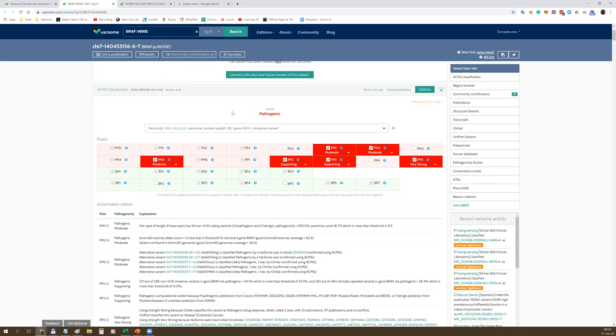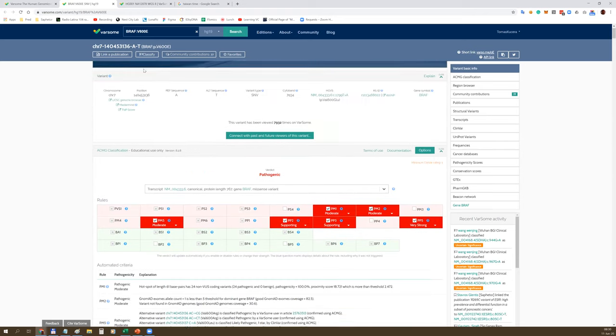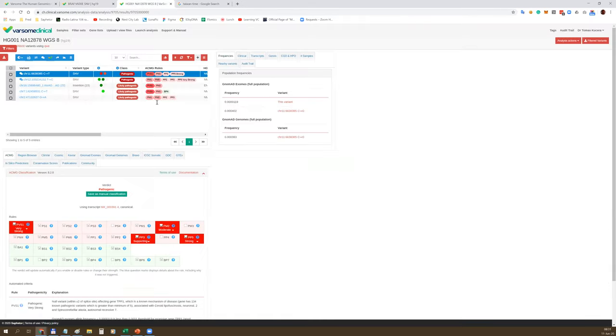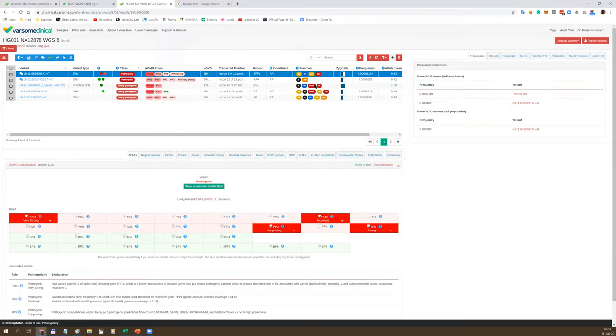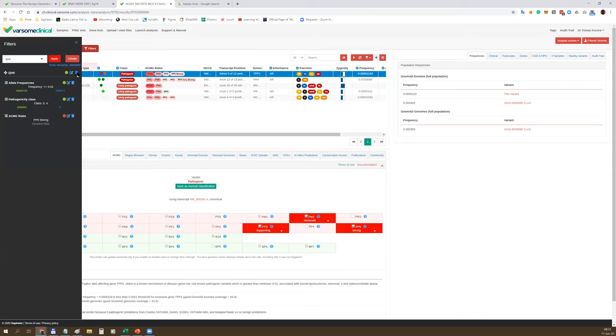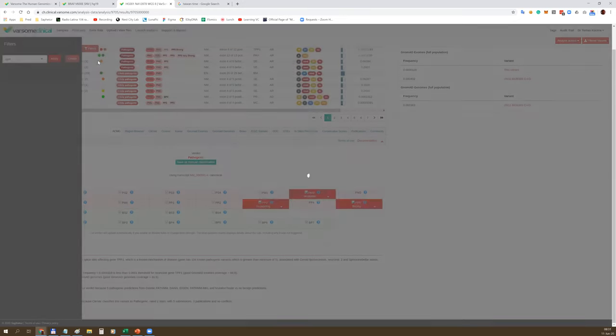It's also flexible and allows you to specify your preferred transcript, which may affect the final classification. You can also specify the strength of the evidence for every single criteria, in line with ACMG guidelines. This is the cornerstone of Varsom and Varsom Clinical - interpretation based on ACMG guidelines. We are now also implementing AMP, NCCN, or ASCO guidelines for interpretation of somatic variation.